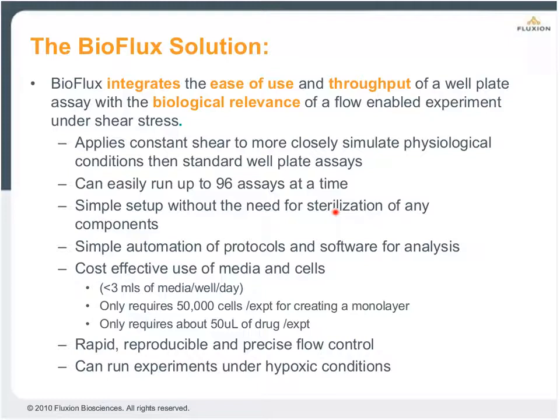Because we use a microfluidic format, which by nature uses small amounts of reagents, this opens up the possibility of using precious reagents and rare cells to their full potential.